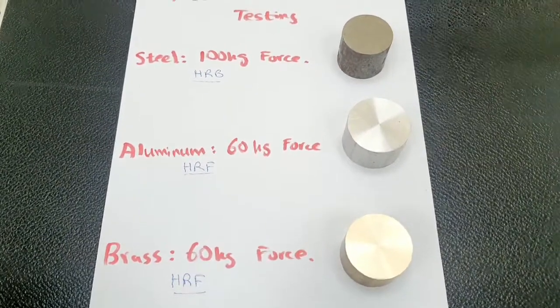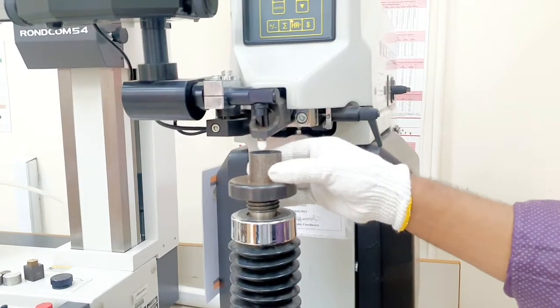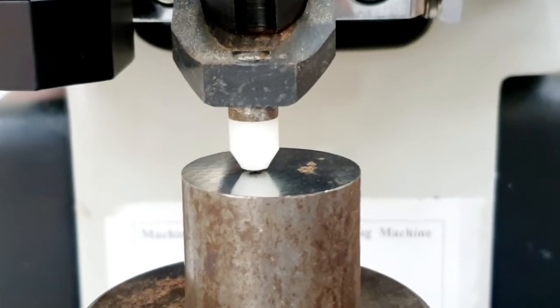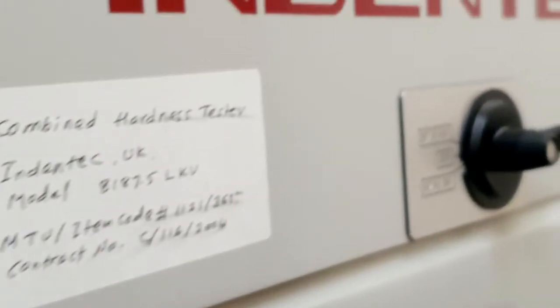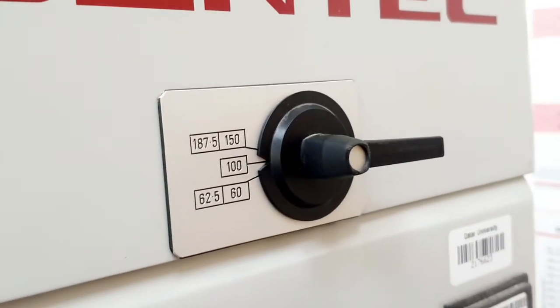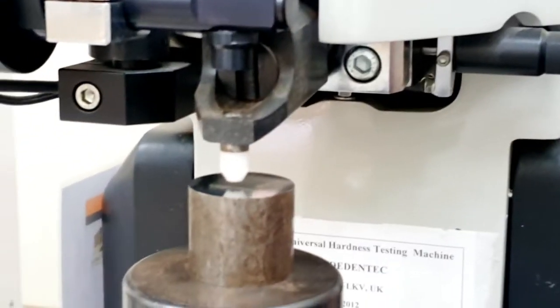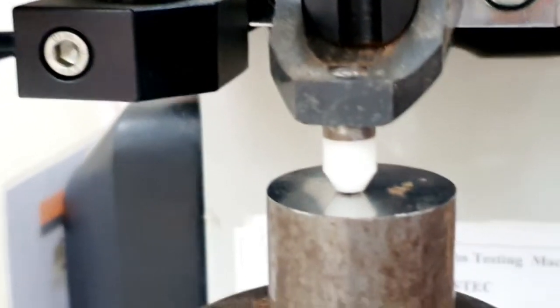Let's continue with our test for the first sample, which is steel. The lab instructor puts the sample on the hardness testing machine table. Then we adjust the table by rotating this wheel to make sure the indenter is just about to touch the sample. Once the indenter is touching the sample, we need to make sure the machine is in the right loading condition — it should be in the 100 kilogram loading position. When we set the machine to 100 kilograms loading, the display turns to HRB automatically. The machine has an automatic system to tell us by making a beep sound when the sample is in the correct position.